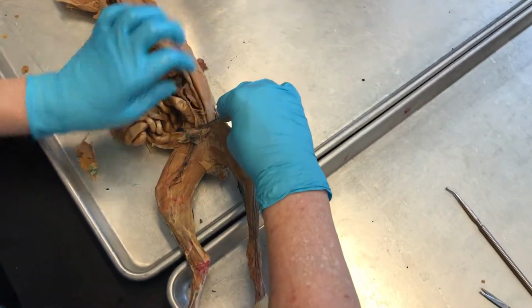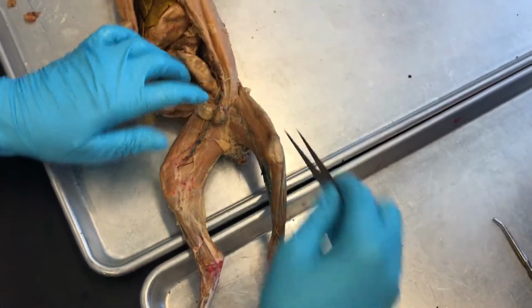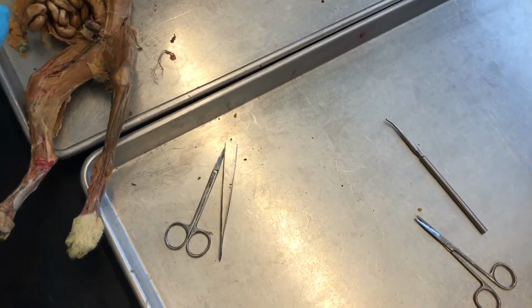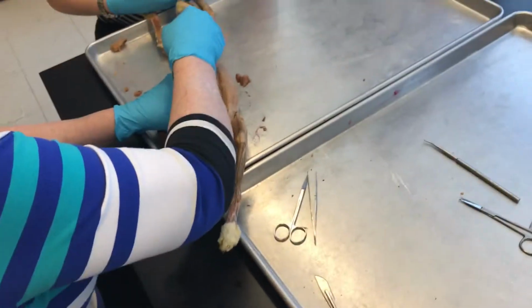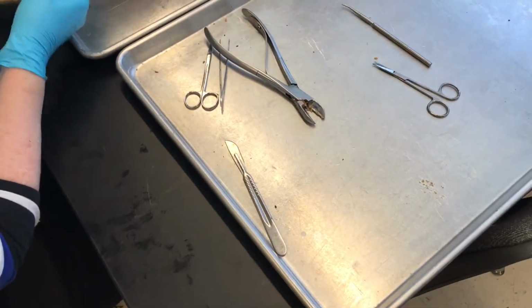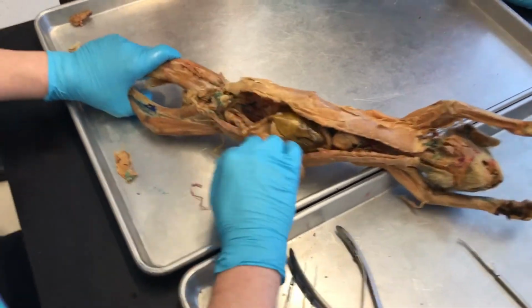Down here is the place where they join together and form a uterine body. And not too far from that is the vagina. To see the vagina, we have to do the same thing we did to the male, and that is break the bones. This is a smaller cat, it's easier to break these bones. Open it so you can see them a little bit.